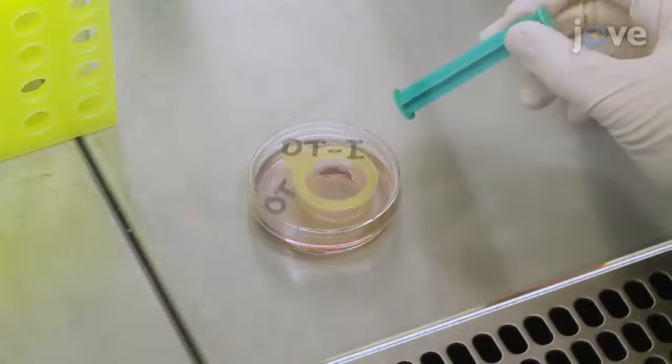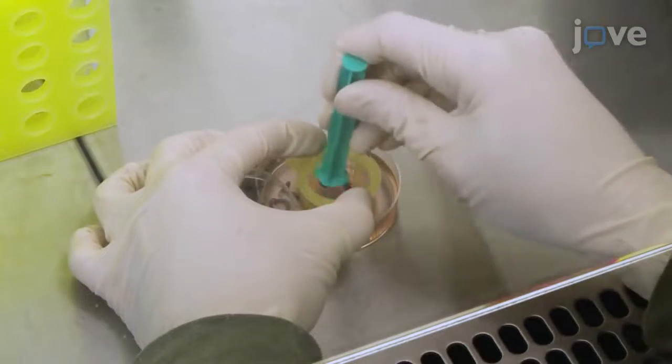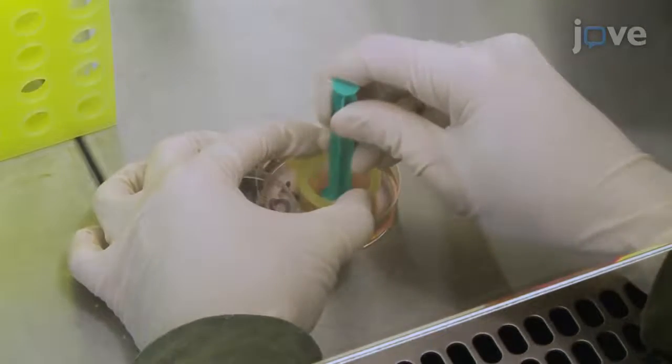When all of the organs have been retrieved from each donor animal, use a syringe plunger to mash the samples through the mesh filter.